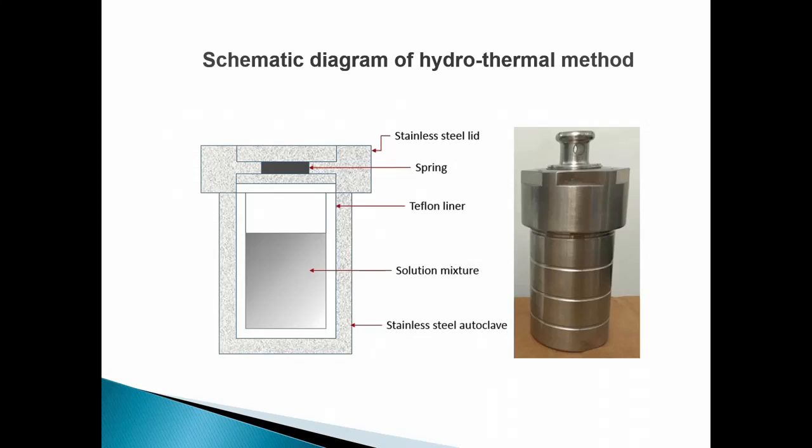The reaction is carried out in water or organic solvents at elevated temperature and pressure for known time in an autoclave. Typically, the temperature in a hydrothermal process falls between the boiling point of water and critical temperature, while the pressure is over 100 kPa. Nucleation and the consequent particle growth that occur under these conditions can result in nano-sized material. To remove the ions and other impurities, the product obtained is washed with distilled water or acetone. By drying in air, fresh well-dispersed nanoparticles can be obtained.